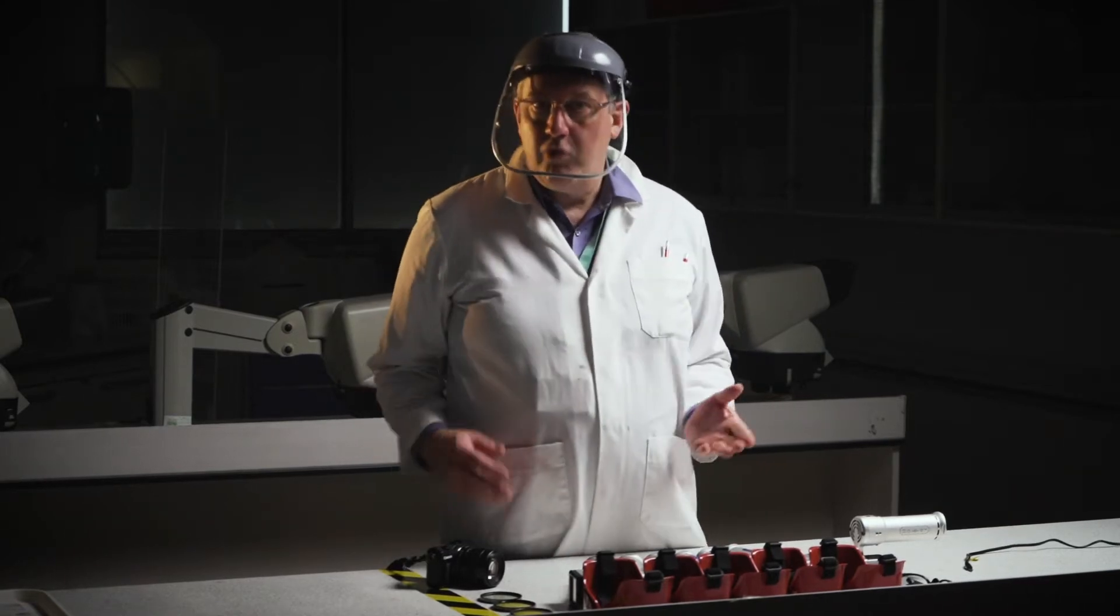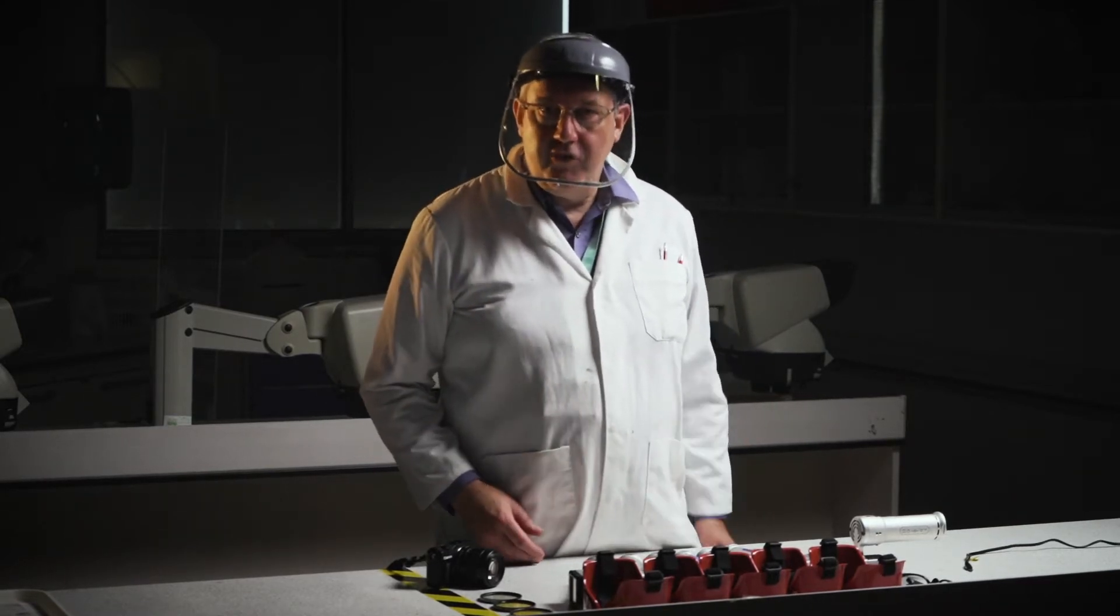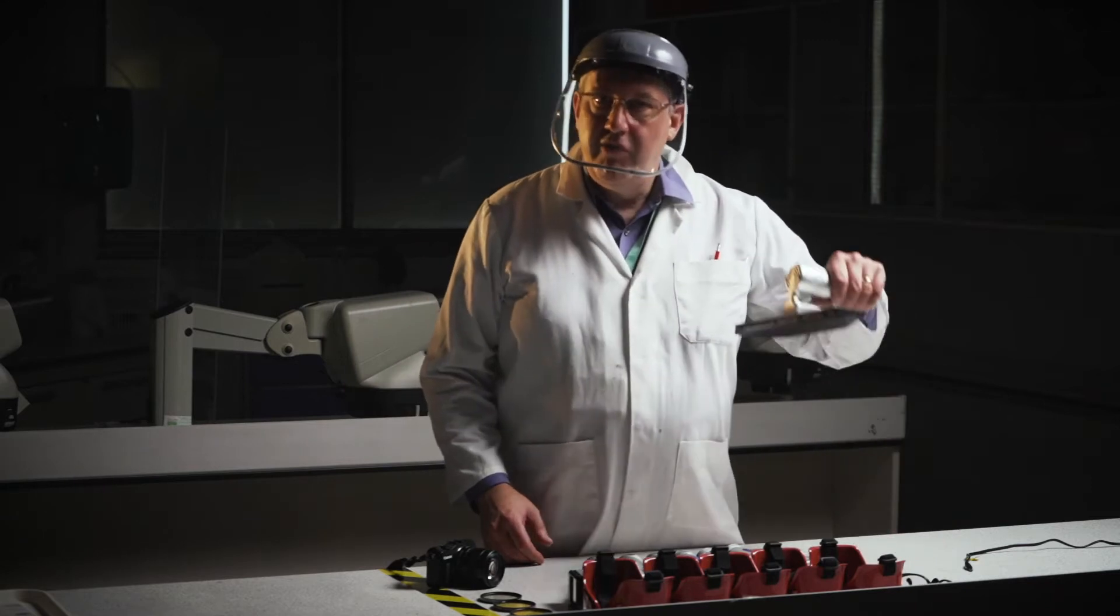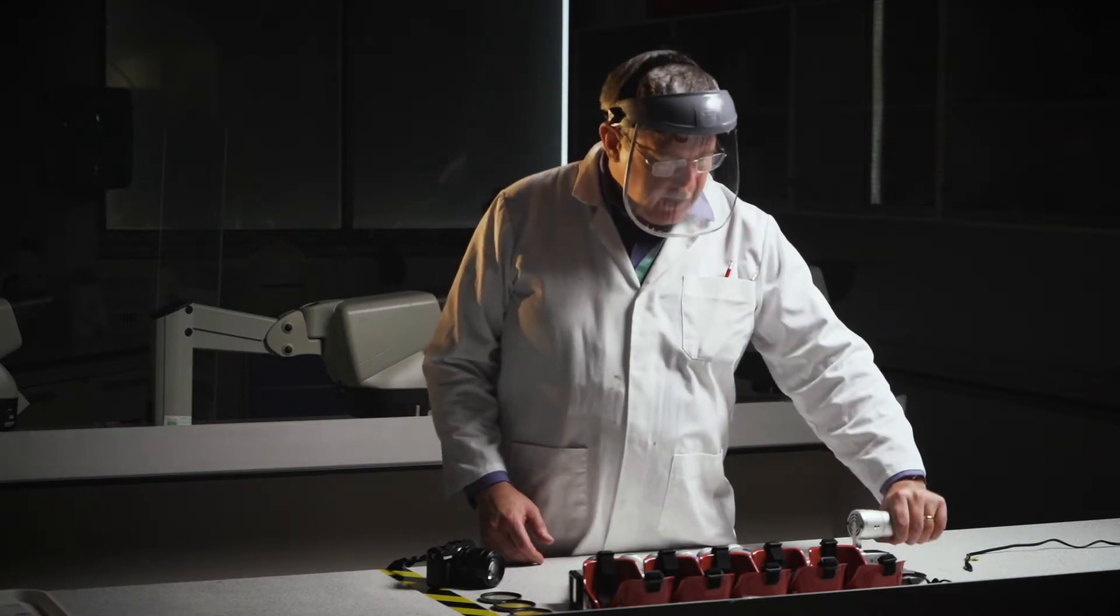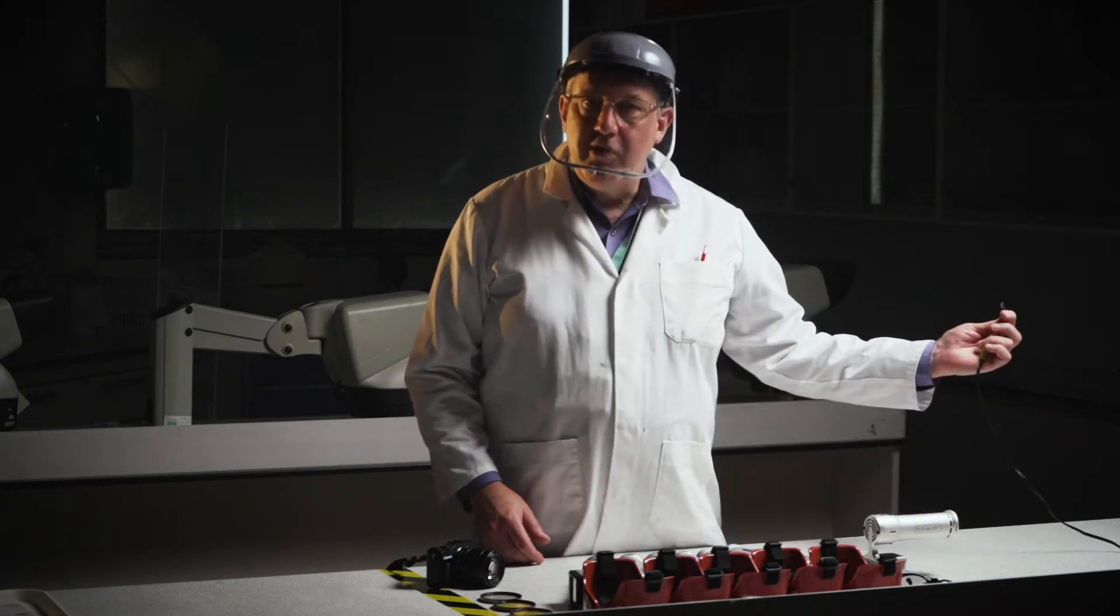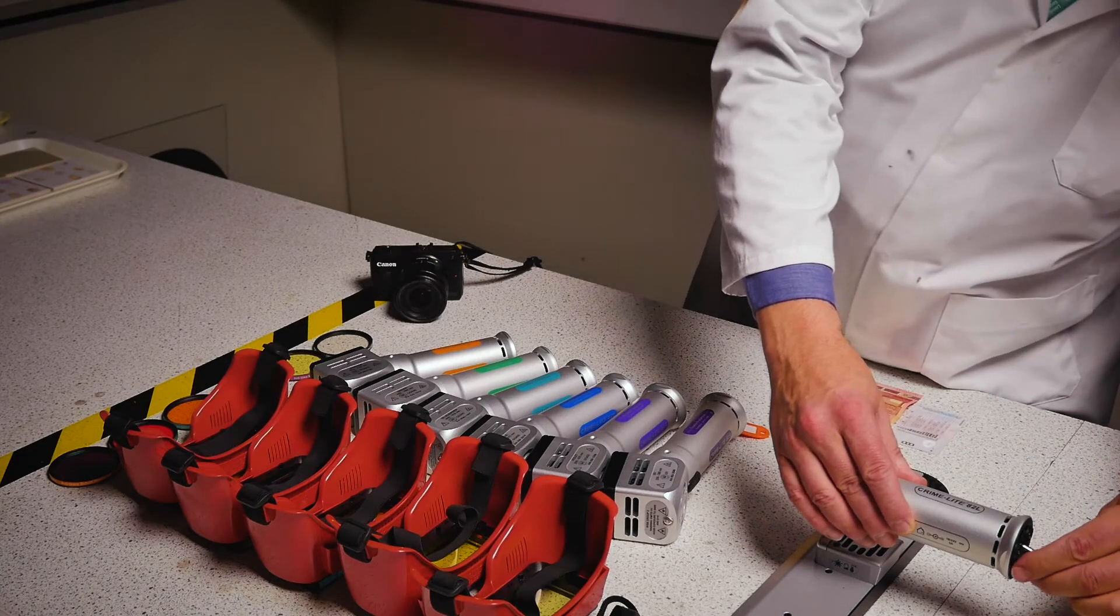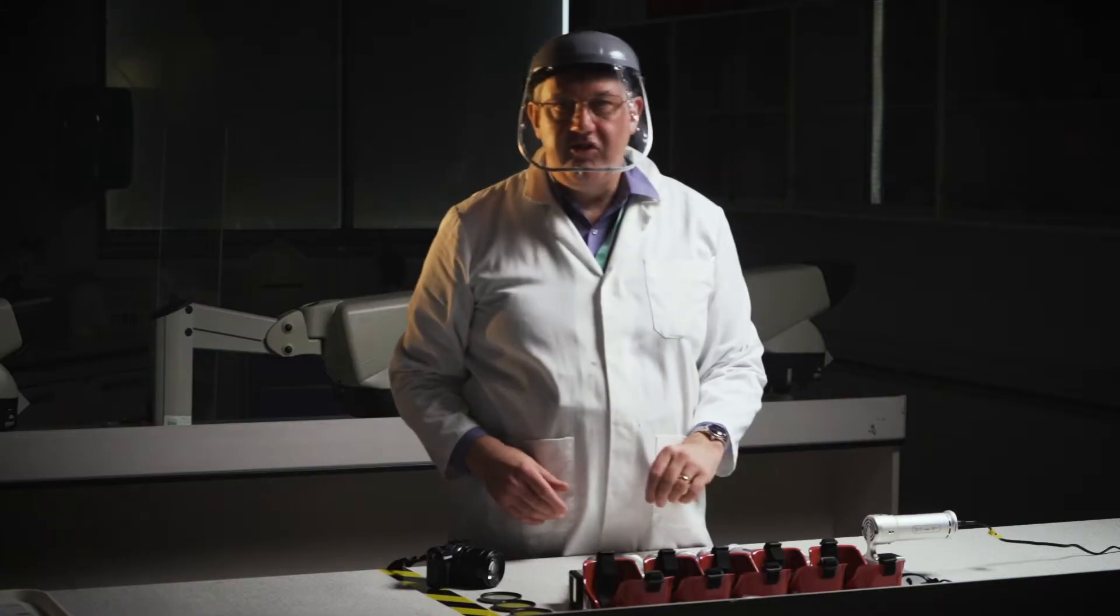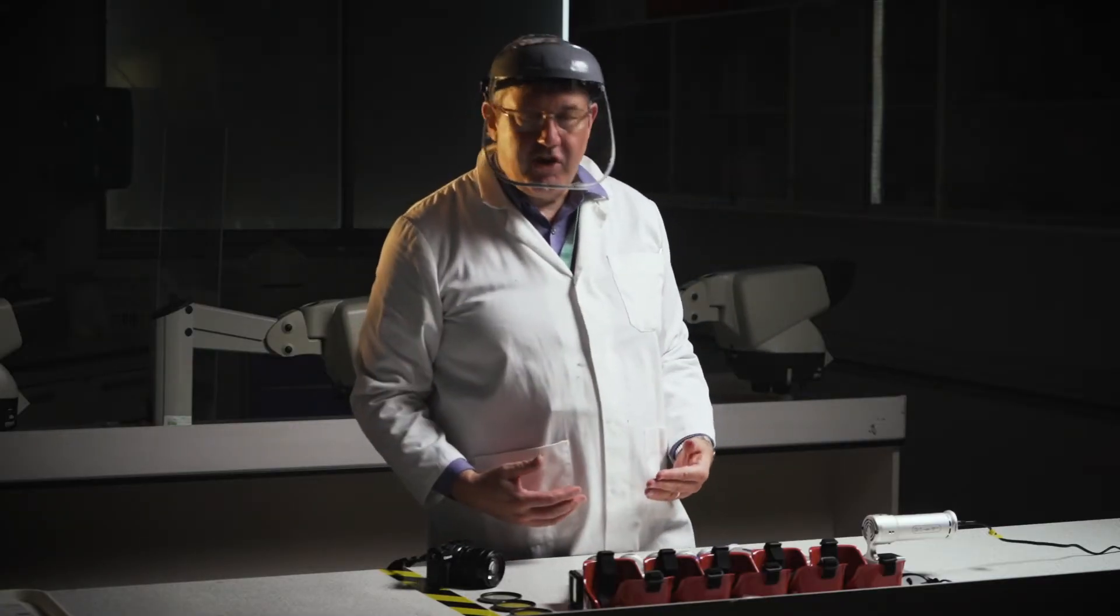So first of all we'll look at the oblique light source, the ATL, which is this light source here. And to connect it for a search we need to put the power lead into the center of the back. So this is plugged into mains, we can also operate it from a battery.